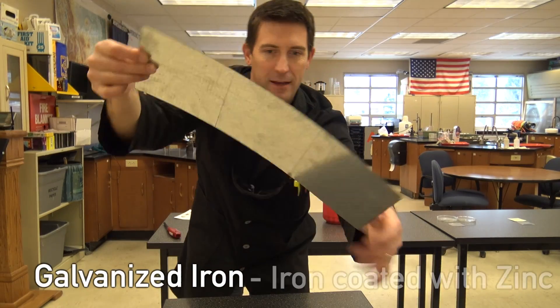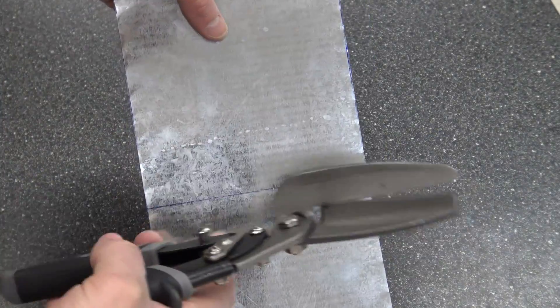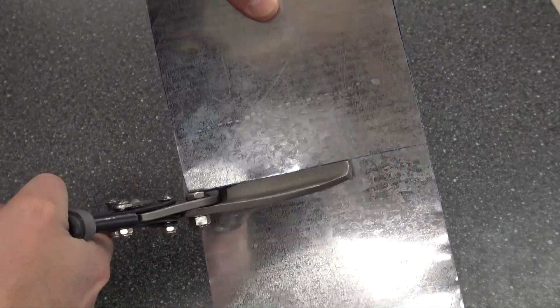We're gonna start off with some galvanized iron. That's just iron that's coated with zinc. Now it's got the zinc on the outside so that it doesn't rust if you use this outside.